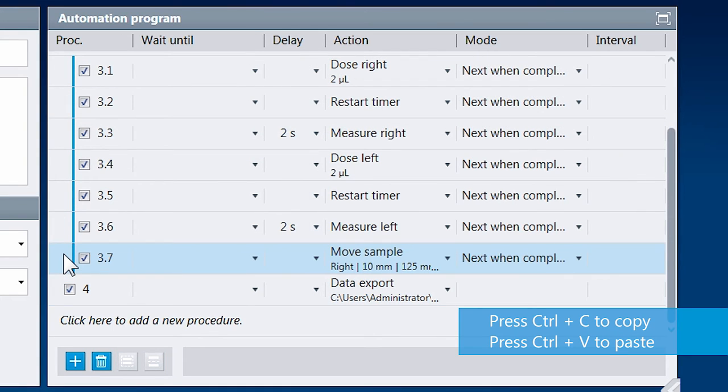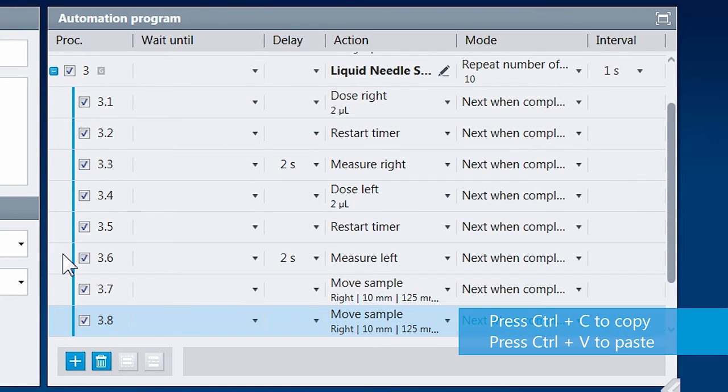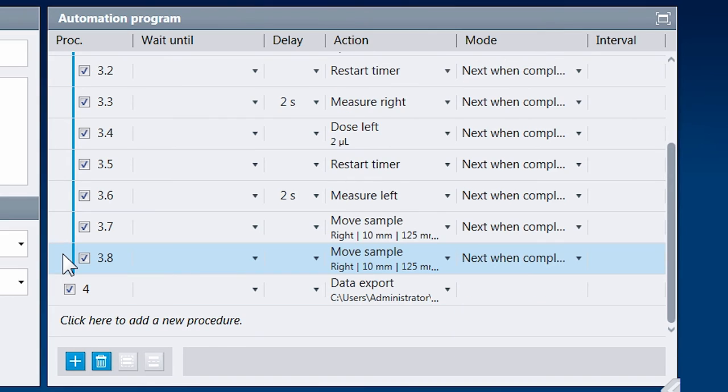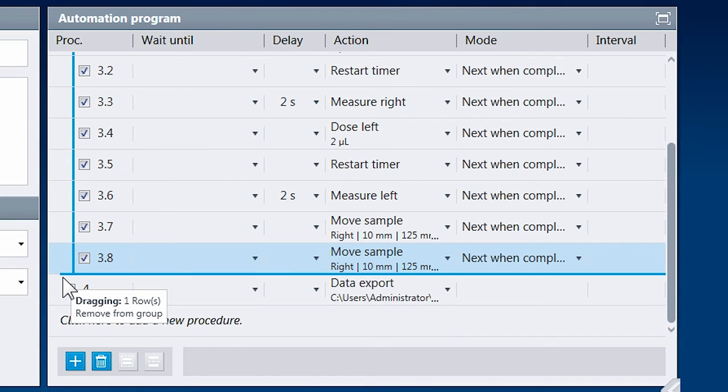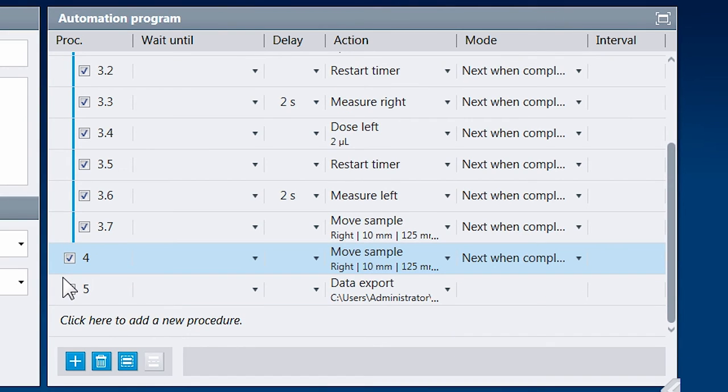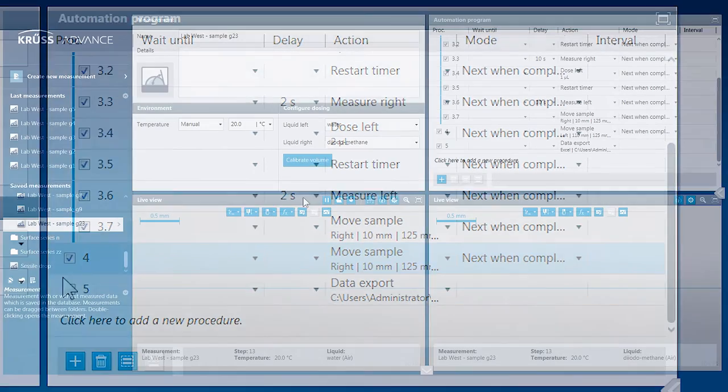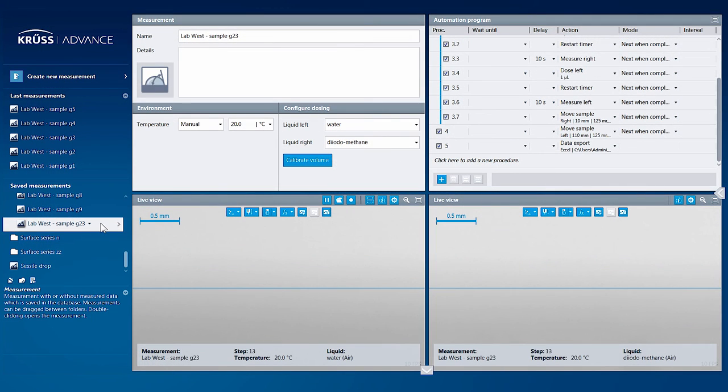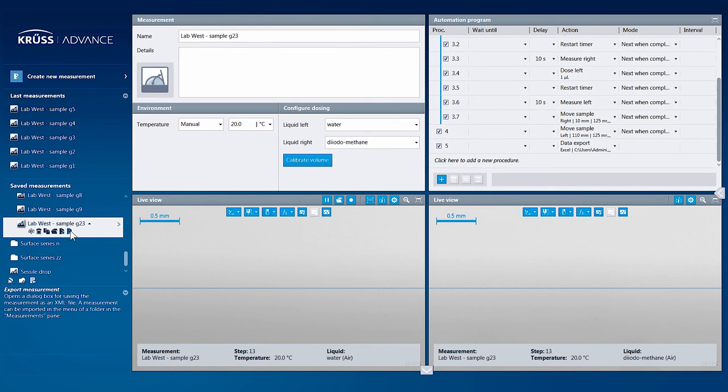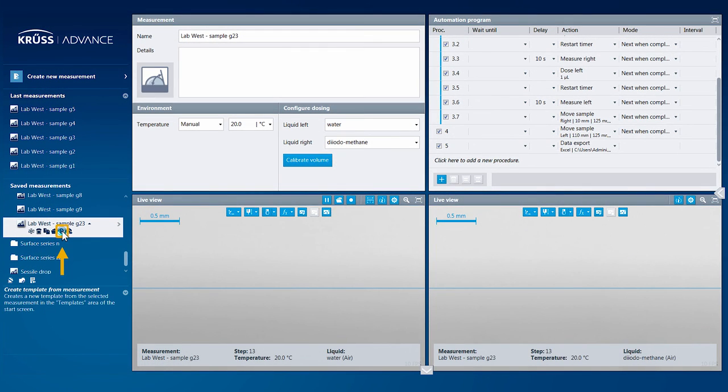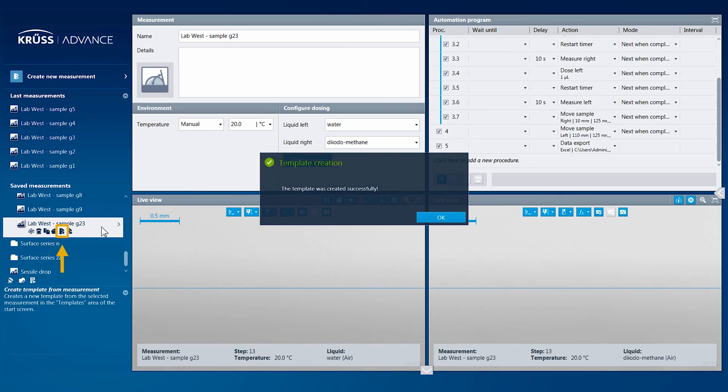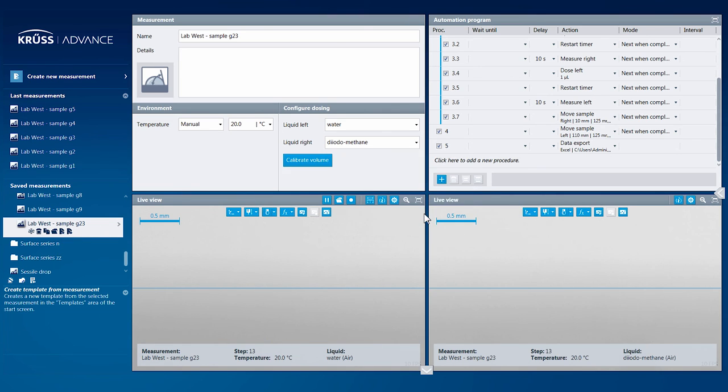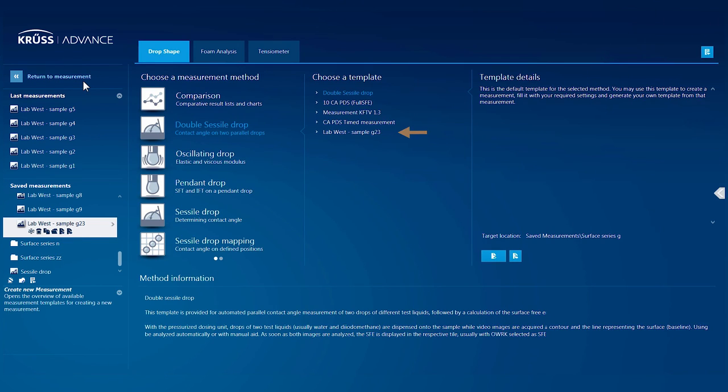Procedures can be easily copied and pasted, or dragged and dropped to change their order. The automation program is saved with the measurement or when you create a template, so that all of your colleagues can use the program exactly as you did.